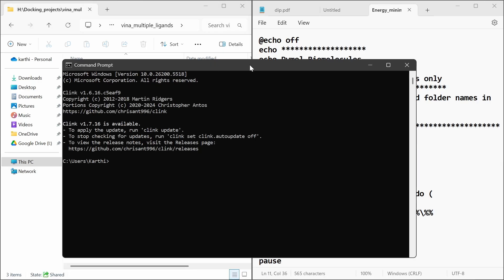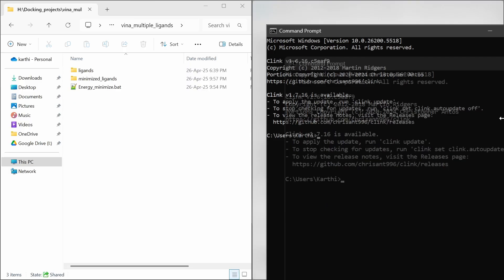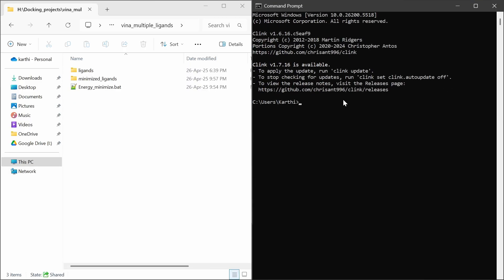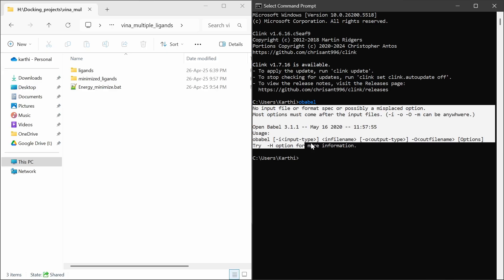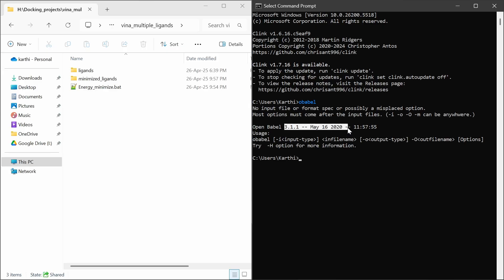For this to work, you have to install Open Babel. Whether Open Babel is installed or not, you can check by running the command 'obabel'. The version I have installed is 3.1.1. If you don't have Open Babel installed, this will not work.